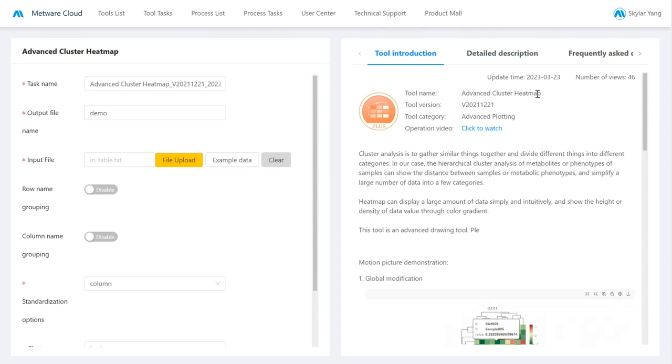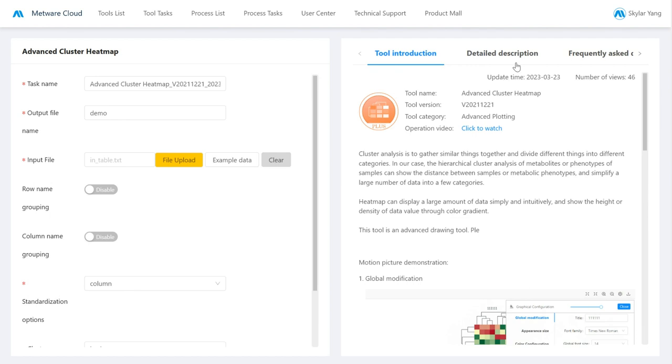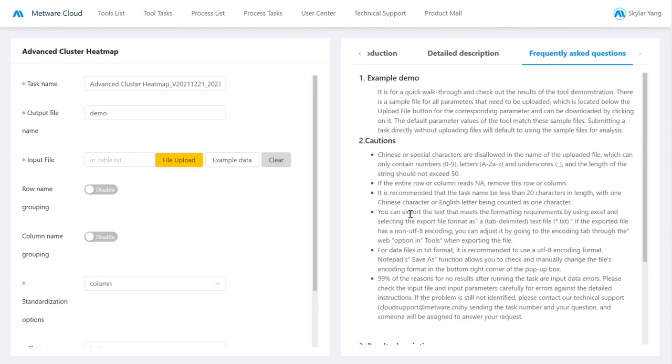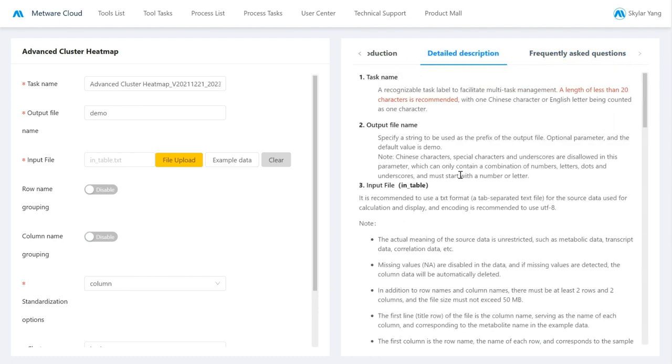In the right column, we will see an introduction, so basically how to use the tool. There is a more detailed description of the options available, and then there is the FAQ for some troubleshooting. On the left, we see the parameters that are needed for us to start using the tool.